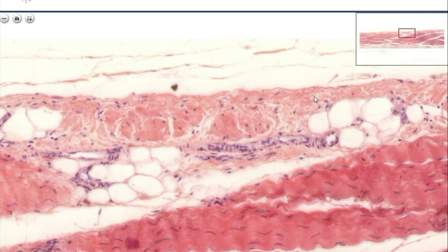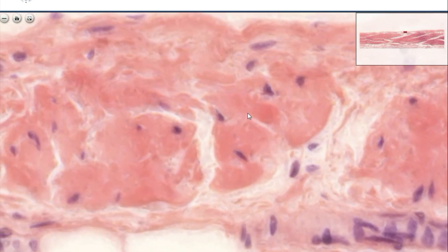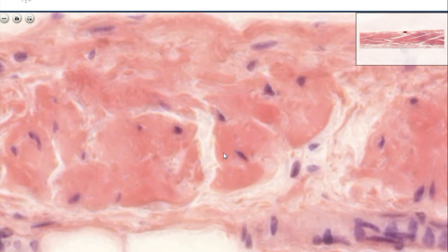Embedded into this looser connective tissue, you also see thicker bundles of even denser connective tissue. These are the cross-sections of the collagen fibers, and because the fibers are in cross-section, the fibrocytes will also be in cross-section.